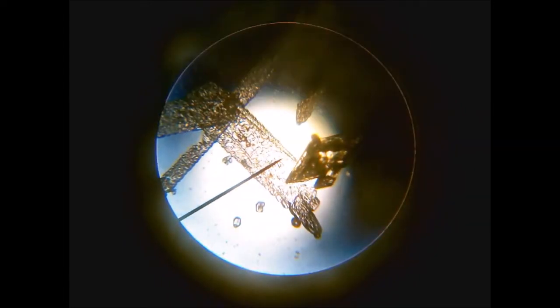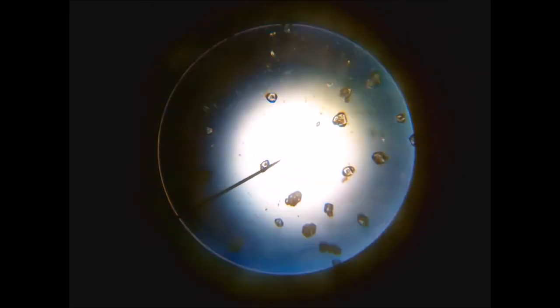As you saw when I was wandering around, and what I was mentioning about these sulfur crystals that I grew this time around, they are more like sulfur sand. Don't get any ideas about black powder, please. So very tiny little lovelinesses, but you can still definitely tell that each and every one of these things is a tiny little orthorhombic crystal. Like this one is particularly lovely. He's beautiful. I just called an inanimate object a he.